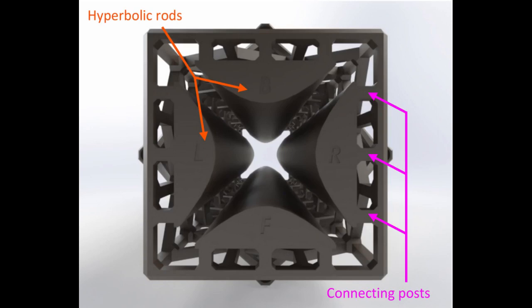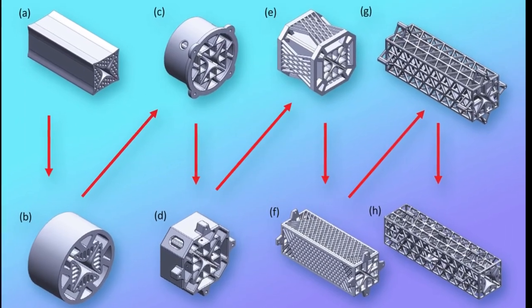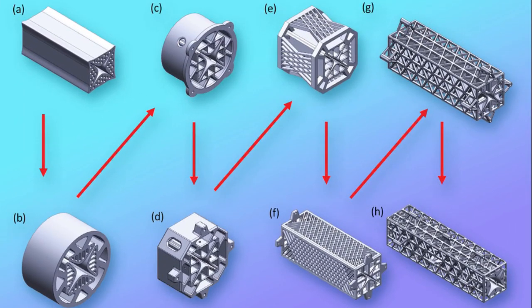To finish the quadrupole, the researchers used a technique called electroless plating to coat the rods with a thin metal film, which makes them electrically conductive. They cover everything but the rods with a masking chemical and then submerge the quadrupole in a chemical bath heated to a precise temperature and stirring conditions. This deposits a thin metal film on the rods uniformly without damaging the rest of the device or shorting the rods.